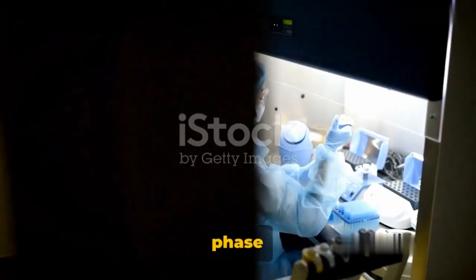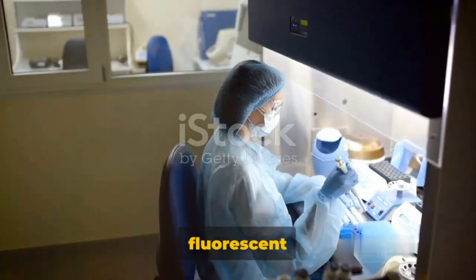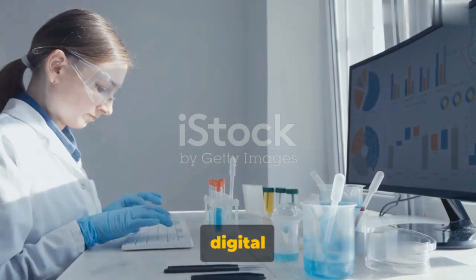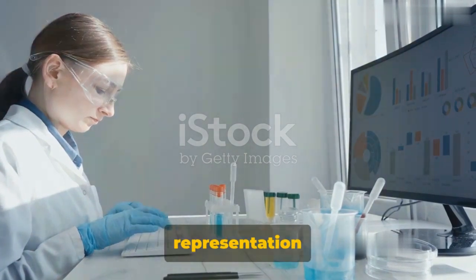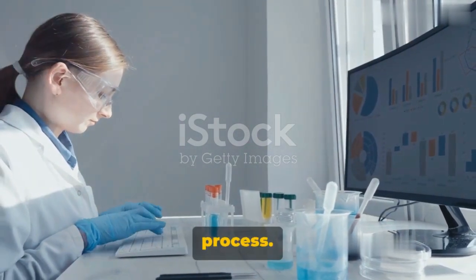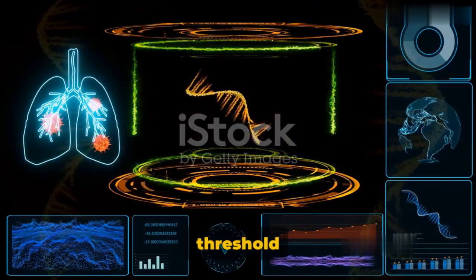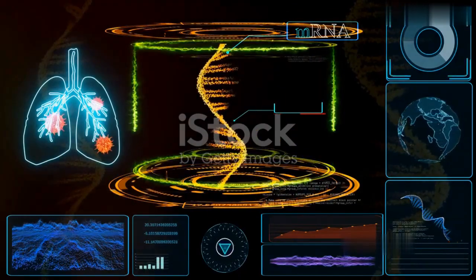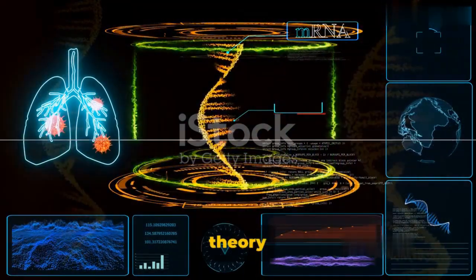Simultaneously, the detection phase is underway. Each time the target sequence is amplified, a fluorescent signal is emitted. This signal is detected and converted into a digital format, providing a real-time visual representation of the amplification process. As the cycle continues, the fluorescent signal crosses a threshold level, confirming the presence of the mutation in the sample. With this example, we can see how real-time PCR brings theory to life.